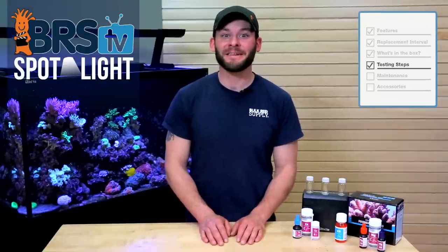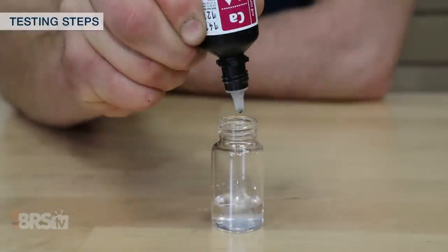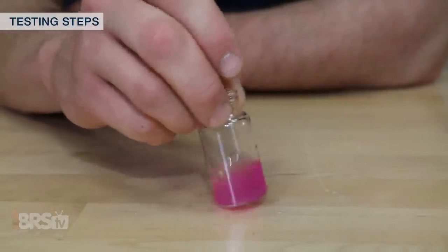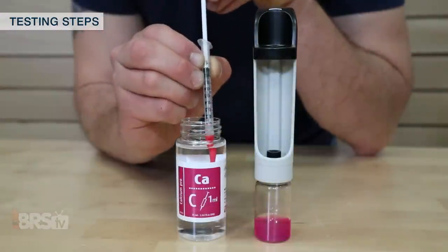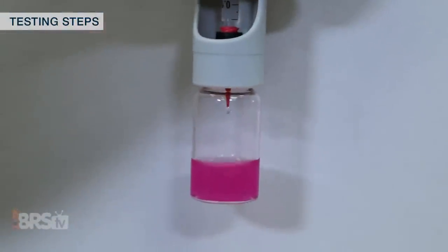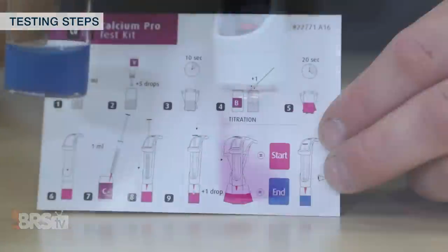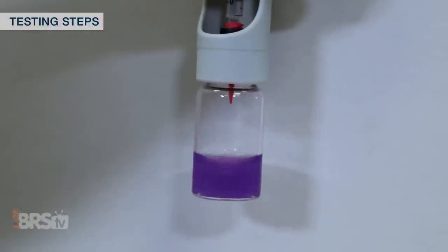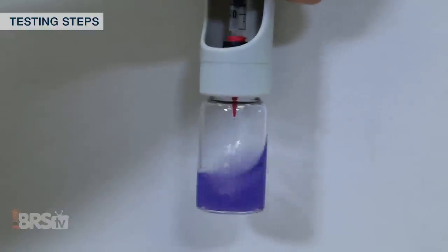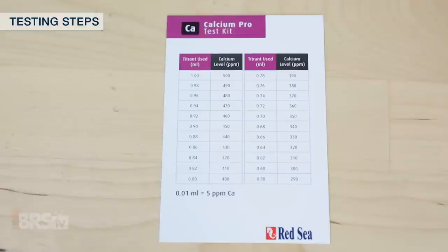The calcium test is performed pretty close to the same, except this test only needs five mils of tank sample water. After that, add five drops of calcium reagent A, gently shake for 10 seconds, add an even spoonful of dry reagent B, shake for another 20 seconds, then start the titration step. I'll draw one milliliter of calcium titrant solution with the red tip syringe, and with the sample in the handheld titrator, begin adding solution while mixing. For the calcium test, we're watching for the sample to change from pink in the beginning to a solid blue color like the one referenced on the testing card. When I start to notice the sample is changing color, I'll slow down to a drop-by-drop process until the sample turns from pink to purple to a fully blue. All that's left is to determine how much reagent I used and match it to the corresponding calcium reading on the chart.